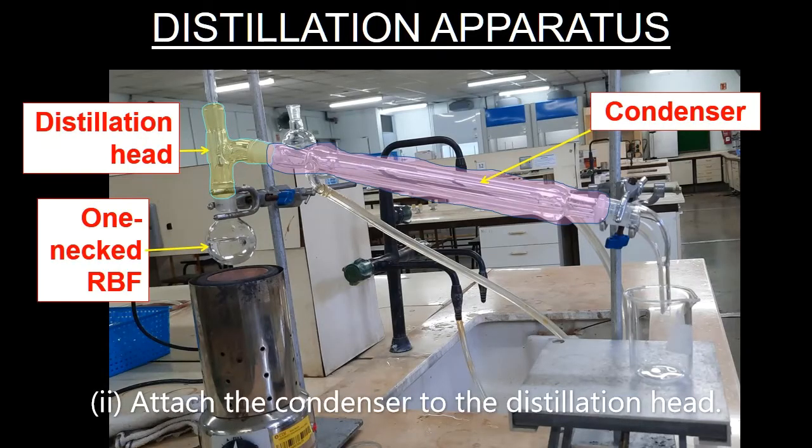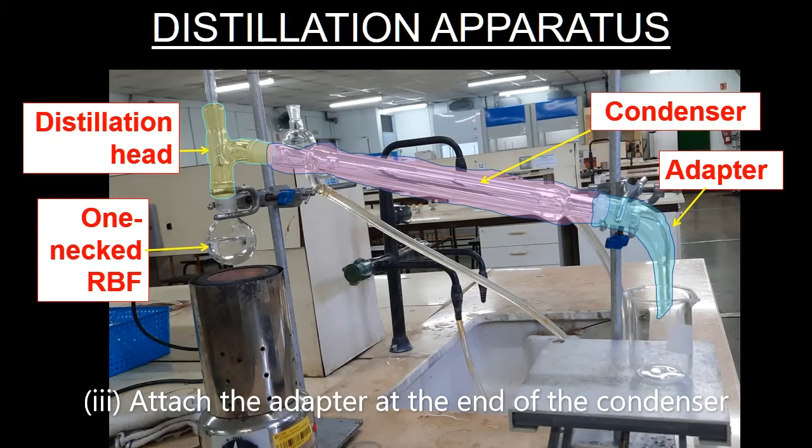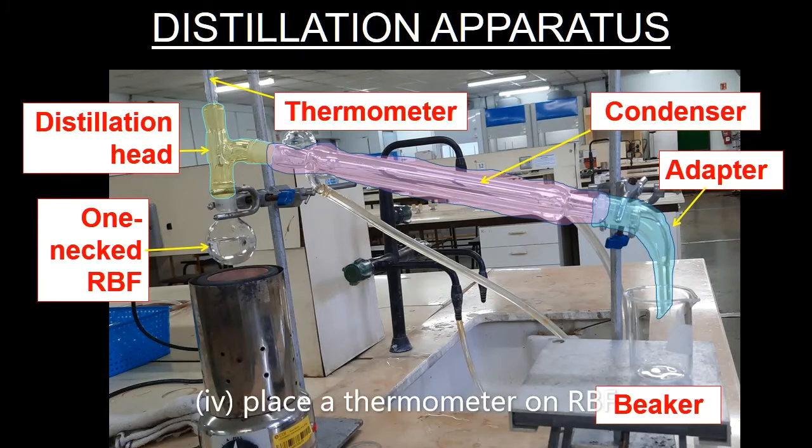Next, attach the condenser to the adapter as highlighted in pink. Then, attach a fraction collector at the other end of the condenser as highlighted in blue. Insert a thermometer into the adapter and place a beaker below the fraction collector.